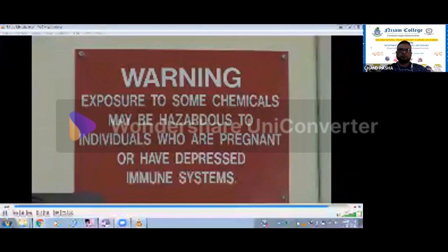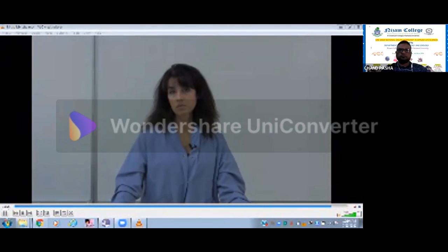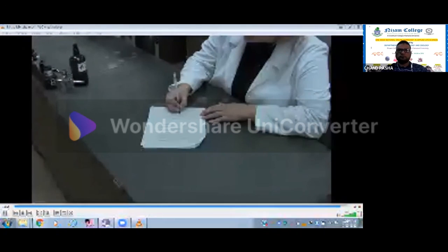If you are pregnant, immunocompromised, or taking drugs that suppress your immune system, please talk with your instructor. Lab time goes by very quickly. Please come to class prepared. Read and underline key points in the introduction and procedures part of the lab. Complete any pre-lab assignments. If you come to lab unprepared, you are more likely to be confused, make mistakes, and not complete the laboratory exercise.